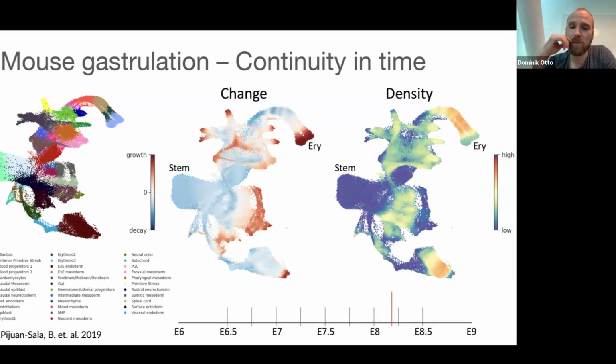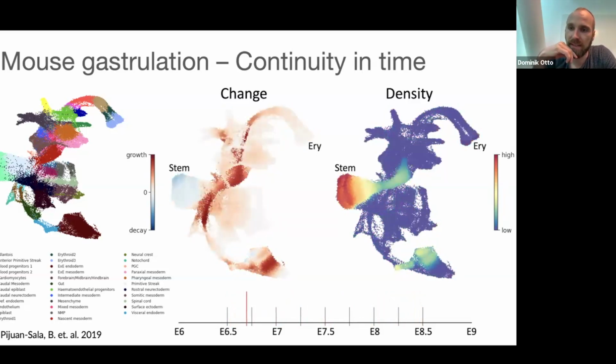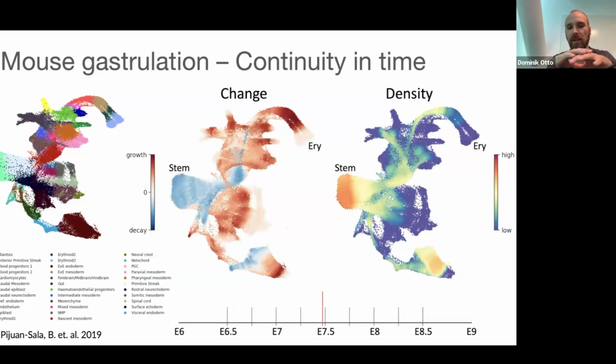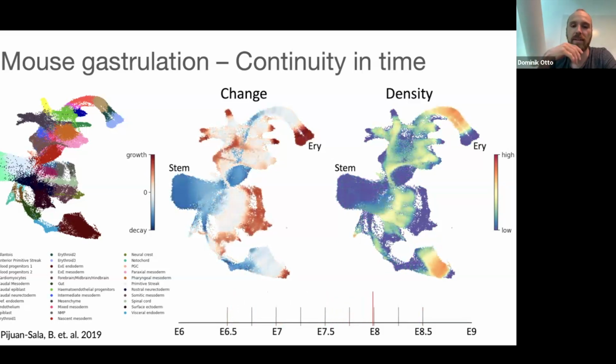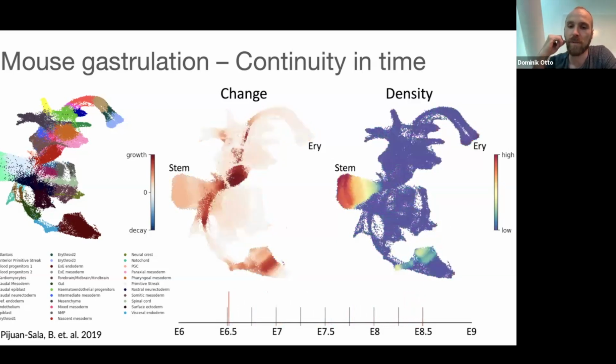And there are other tools which also do a great job on this, like MELD, for instance, that gives you a per cell density abundance difference. But I think we can even go beyond this by evaluating it in between, for instance, or bringing in new data and then computing the density on this and comparing between multiple conditions.